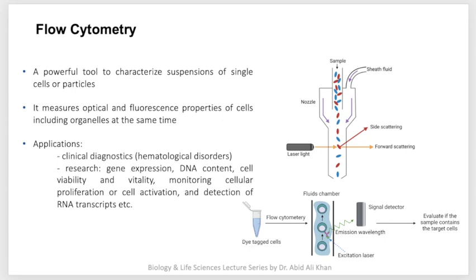Okay, so continuing this, we will talk a bit about the basics of flow cytometry. After the introduction, I would just focus briefly on what the principles of flow cytometry actually are. One of the major principles of flow cytometry is hydrodynamic focusing. This means that the sample and the sheath fluid, so we can see that the sheath fluid is going to be running along the analysis all the way through.